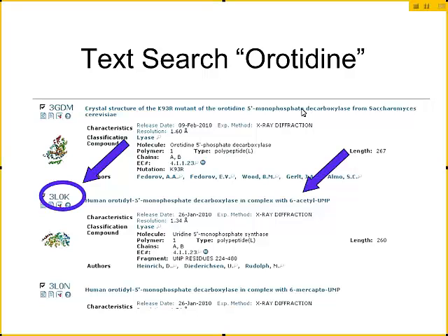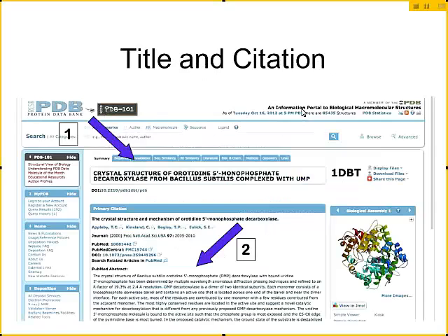You'll see a brief summary of each of the structures. Up here in the upper left-hand corner you'll find the PDB ID. You'll find the title of the structure and information about the method — these are mainly x-ray diffraction structures. You'll find some basic information about the authors and the resolution. You can click on either the title or the structure ID, such as 3L0K, and it will pull up the summary for that page.